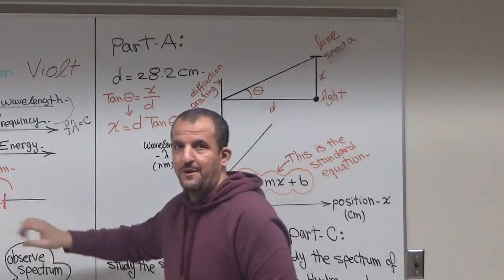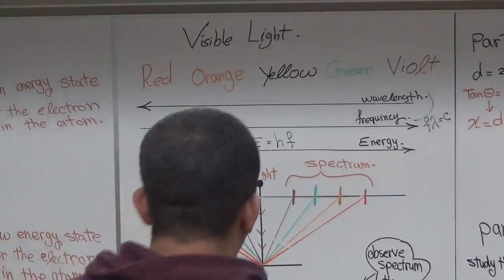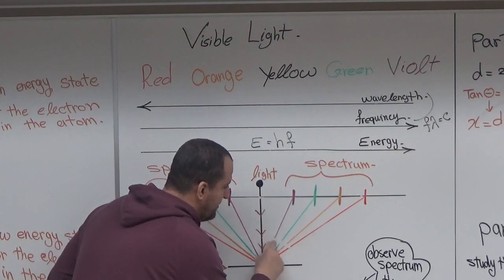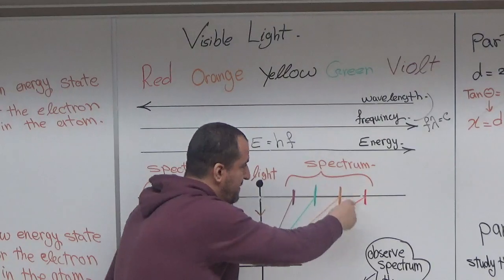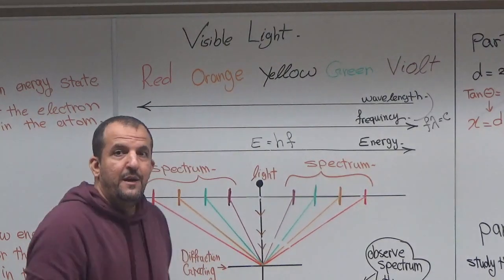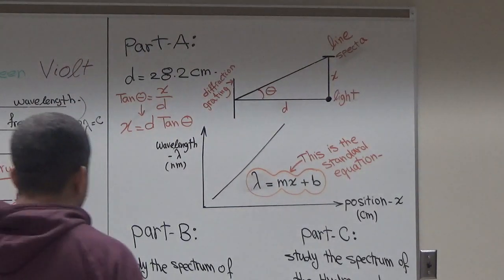So if we come here, if you know the angle theta that we have right here, you can use that angle theta to figure out the distance. For example, for the midline. So you can use that to figure out the distance for the red line, for example. Do that for Mercury, and Mercury would be our standard. So do that for Mercury.